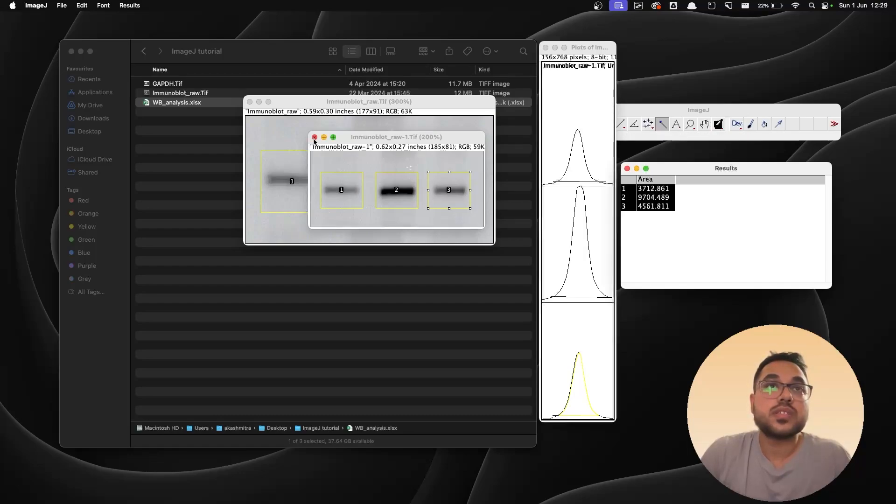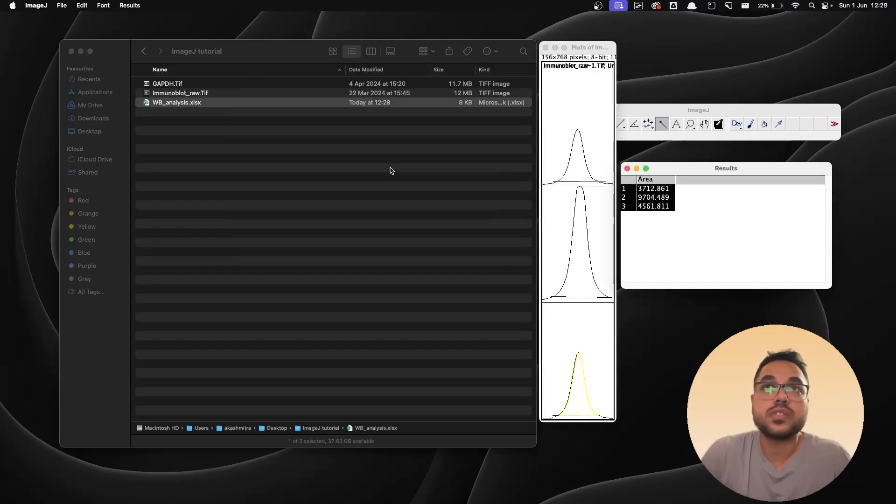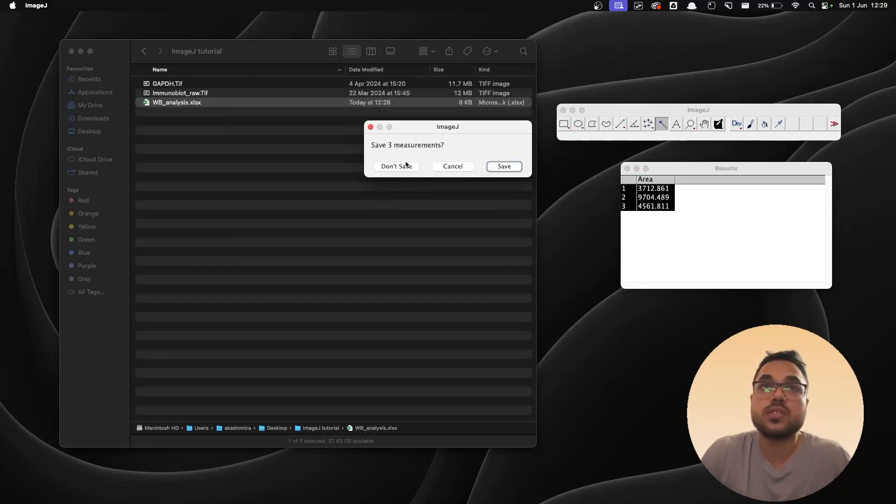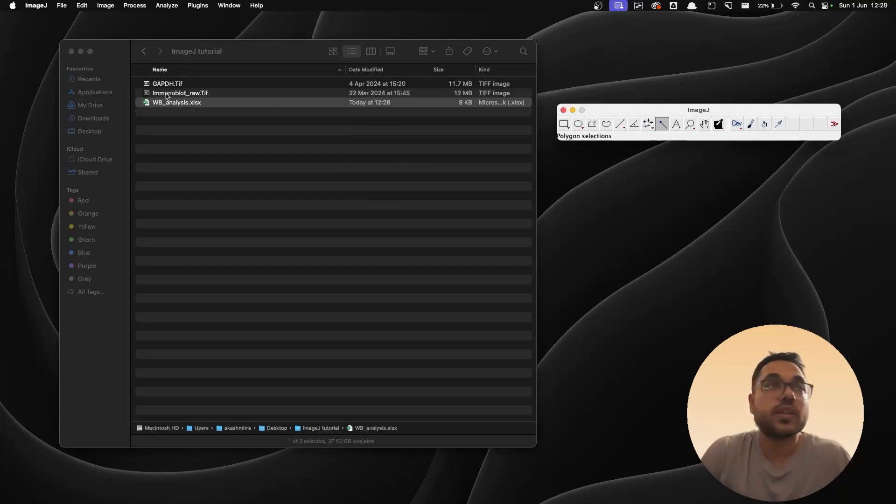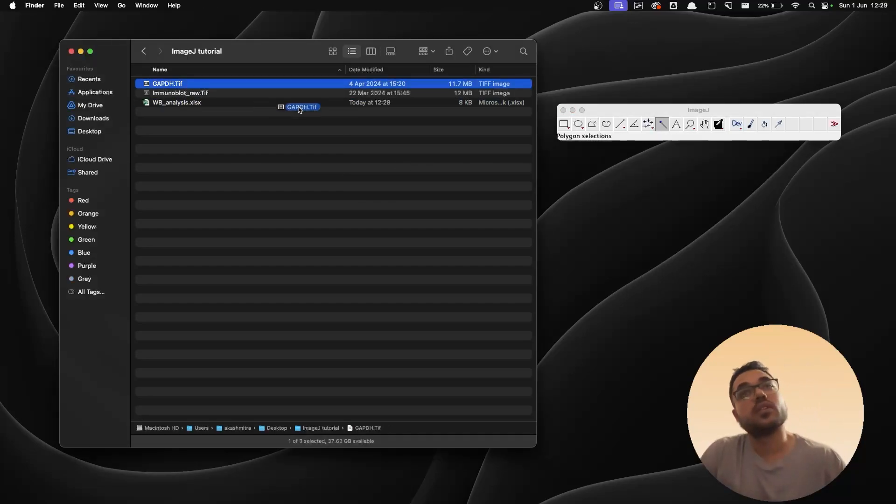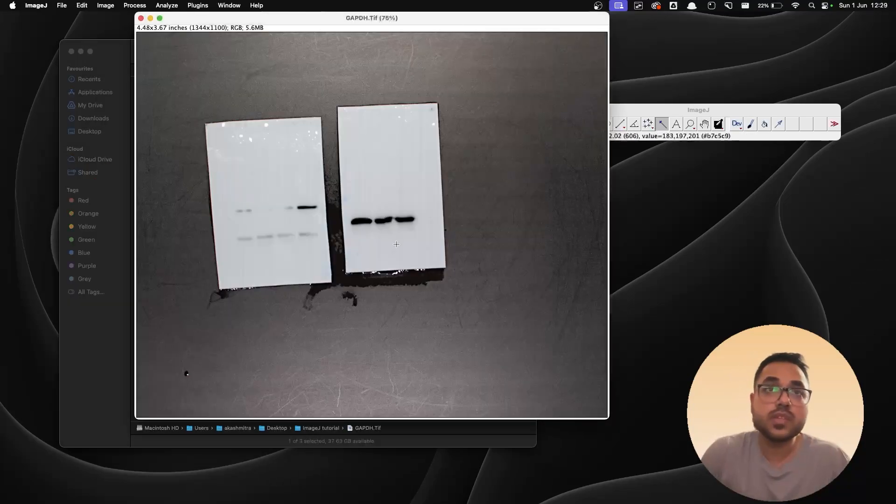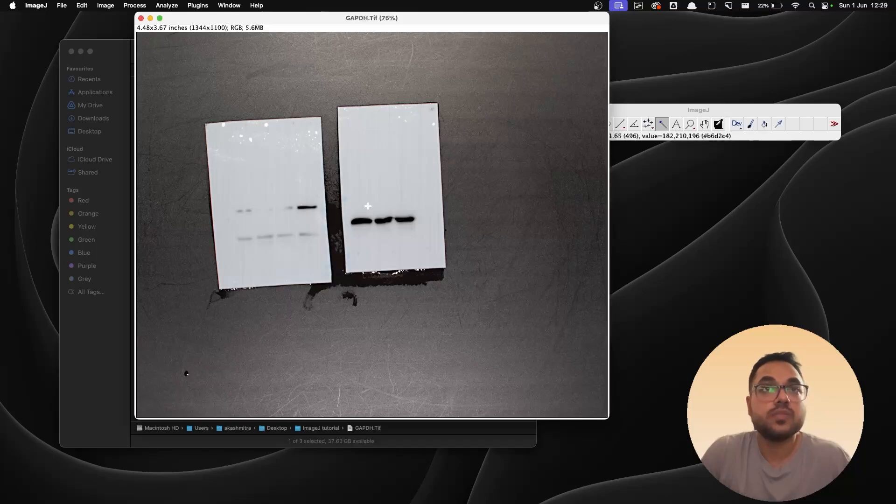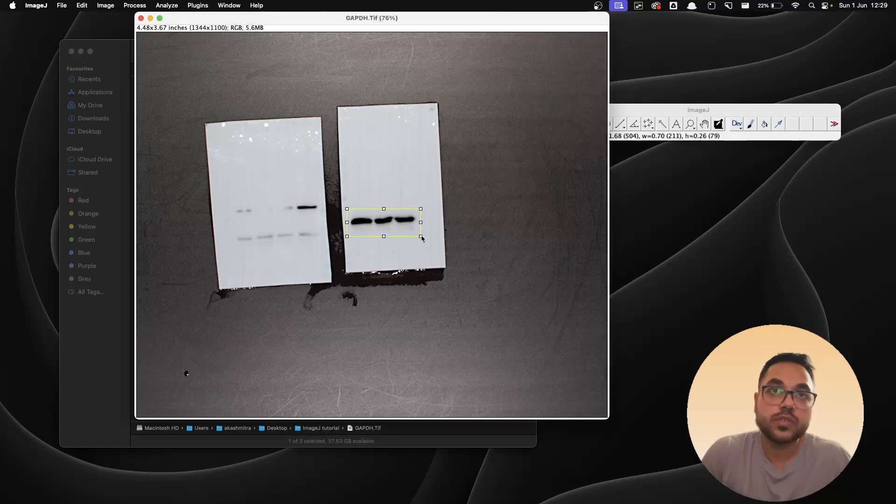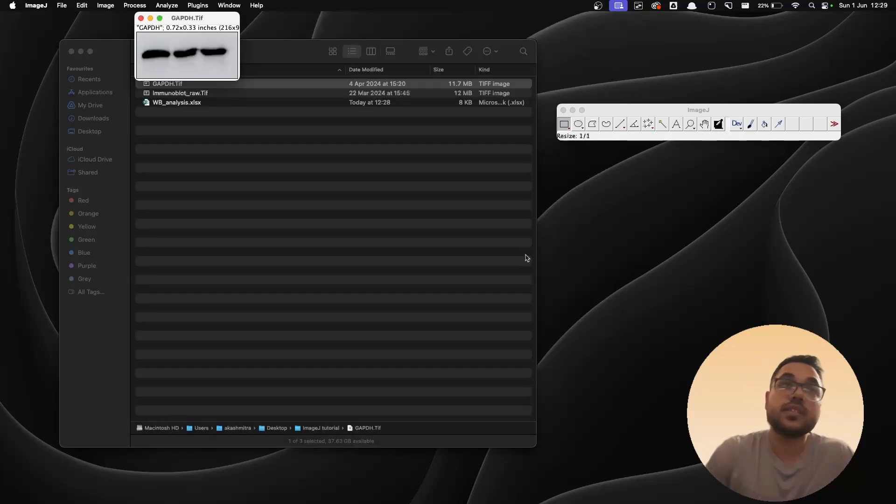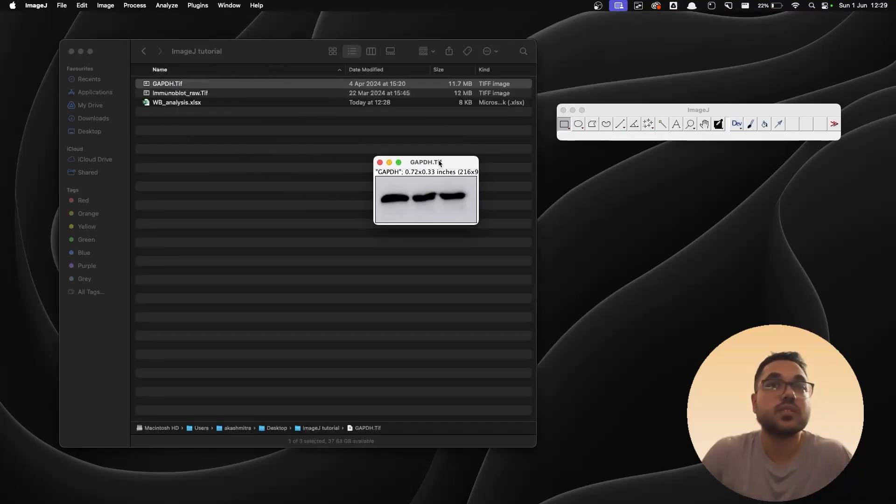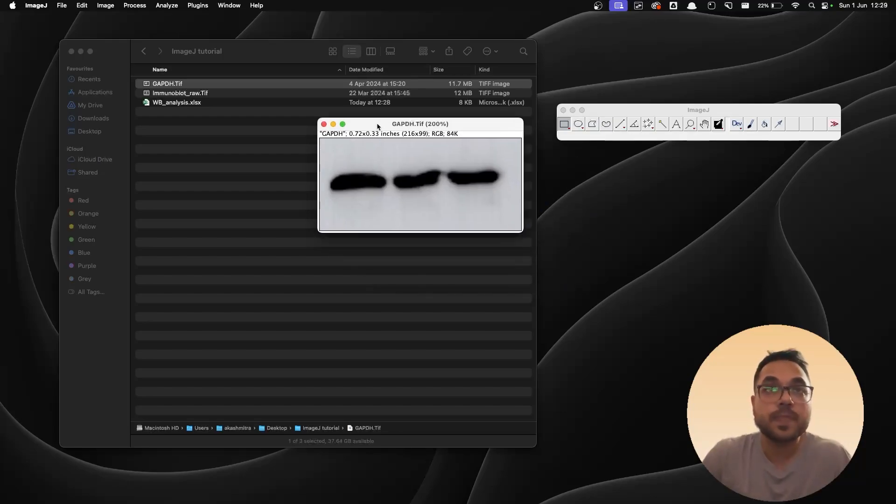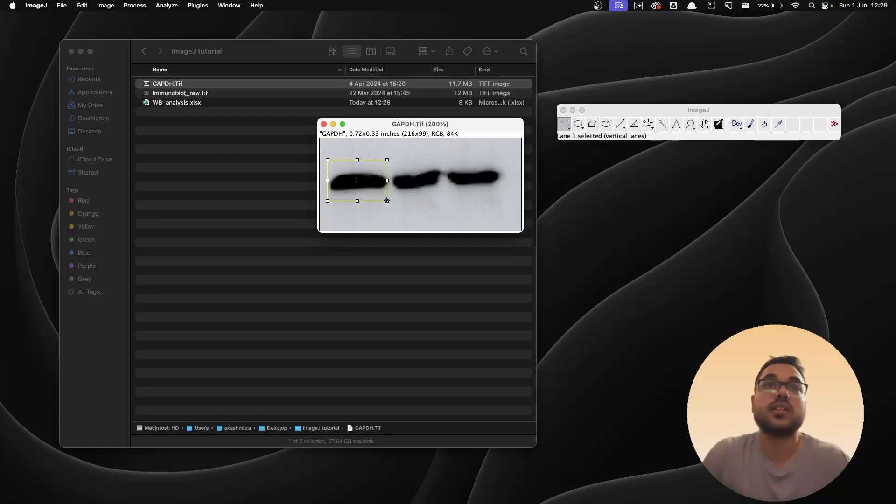And once this is done, I'm gonna close this, say don't save, close this as well, this too. Now it's time for the second one, the GAPDH. Again I'm gonna drag and drop it over here. Again don't worry about the left one, we're going to work with the right one. So the first step is cropping the portion that we want. We crop out this portion, increase the top and the bottom a little bit, and Command+Shift+X, it gets cropped. Increase the size a little bit.